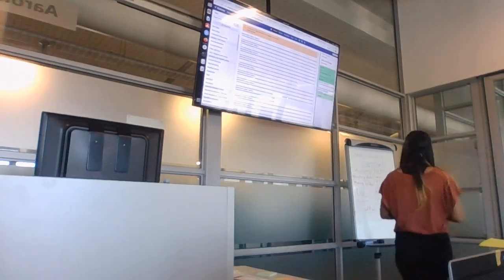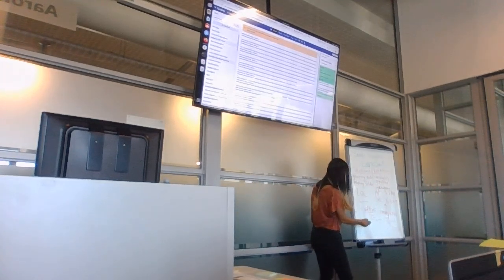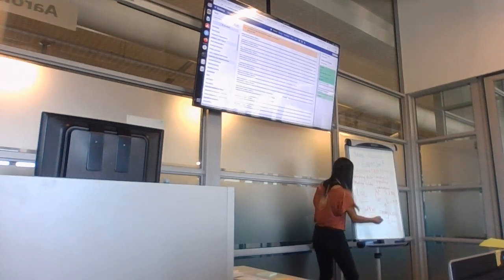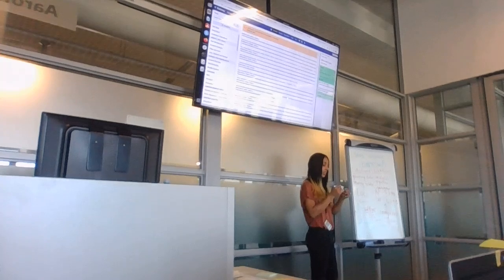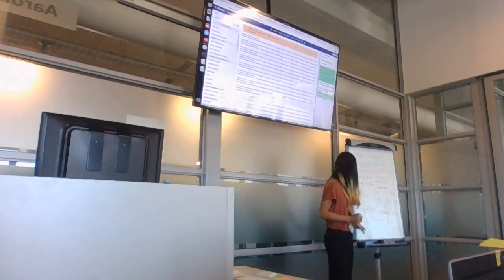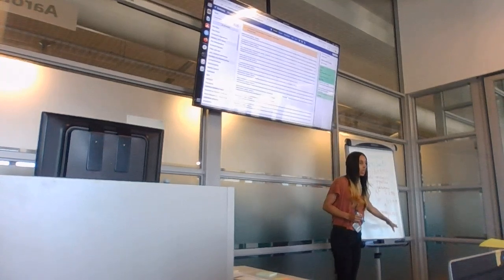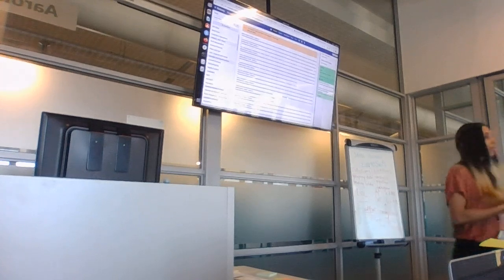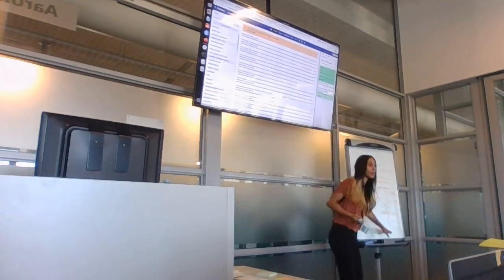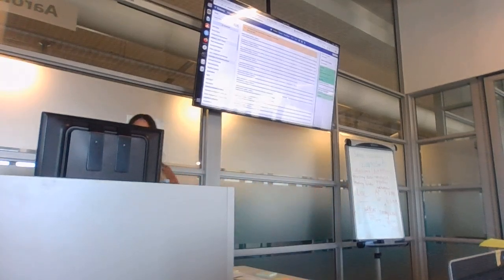So just because you have one long read in a forward file, and you're saying we're putting that read into Kraken, and then here we have a short one, and we're putting that read into Kraken, right? And you're saying based on this having more information, maybe it will give a different result. Yeah. But they're comparing all the reads. So it's very unlikely. If you just took one, then maybe it's a problem. But the forward file here has all of these reads.